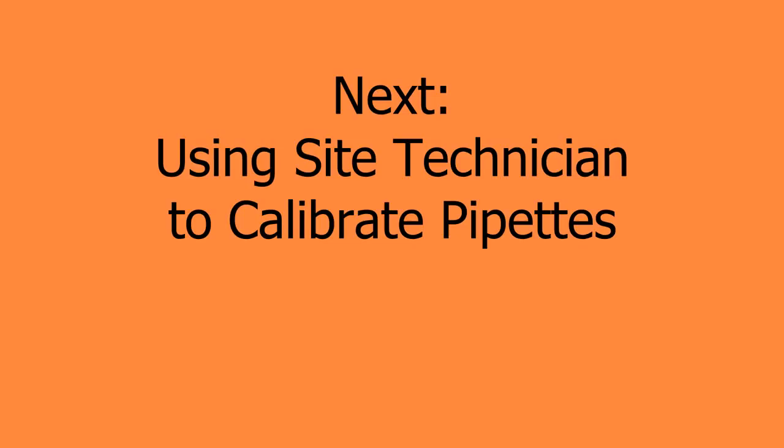So now what we're going to do is to show you how to operate the Site Technician with a laboratory balance to automatically acquire the test calibration data and perform the calibrations for you, and that is coming up in the next tutorial.